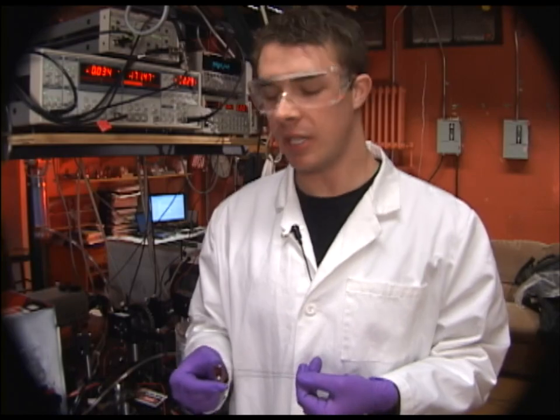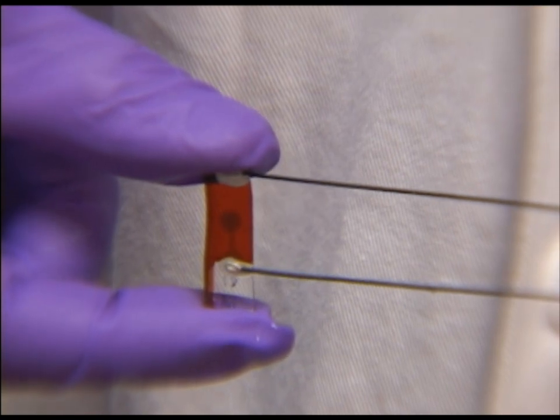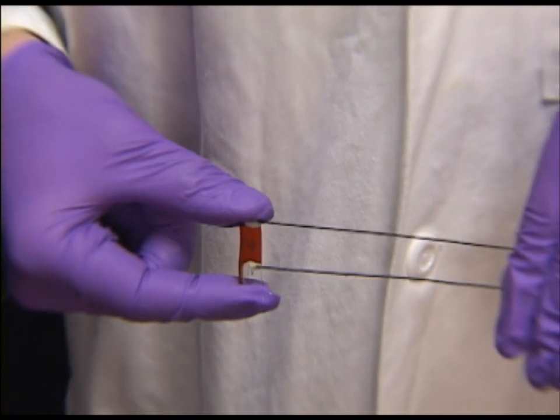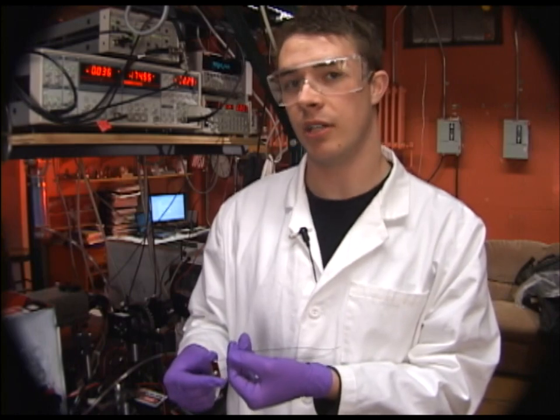This is a sample that we characterize. It is an ITO glass slide that has been spin-coated with a host polymer chromophore system, which is the material of interest, and then sputter-coated with gold electrodes. We've then attached two wires, one into the ITO side and one into the gold electrode side.